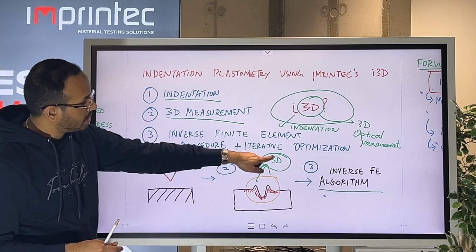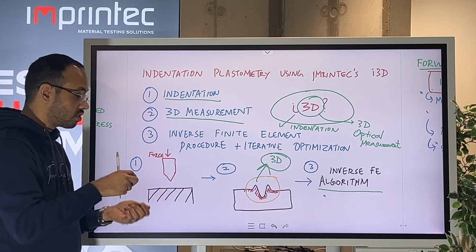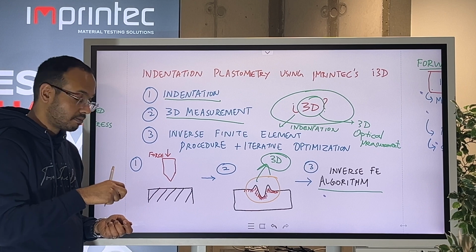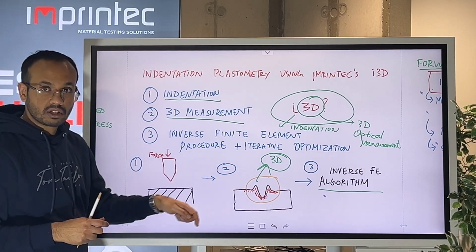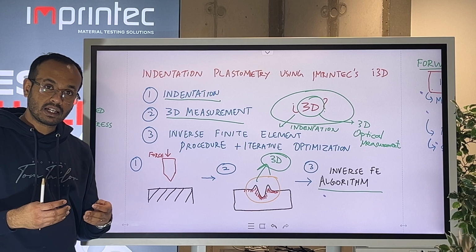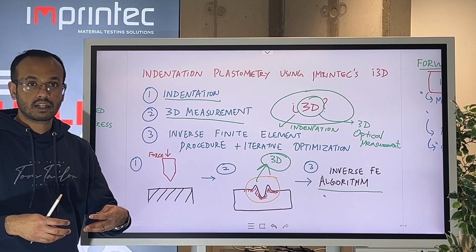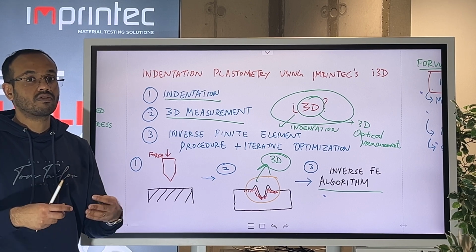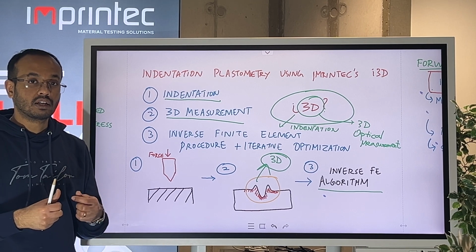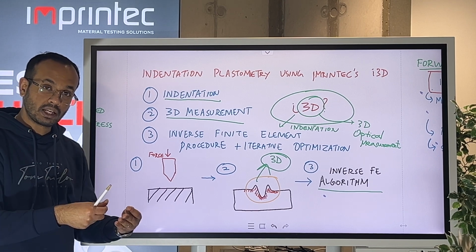This plastic deformation is recorded using a 3D optical measurement system. What is the importance of this plastic deformation? Every material deforms under load very uniquely, very similar to how a human fingerprint is unique to the human being.